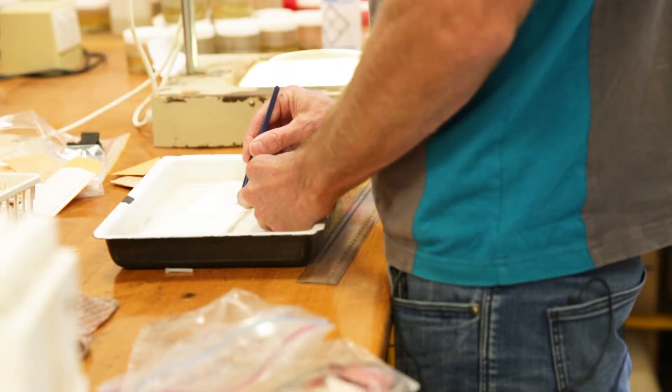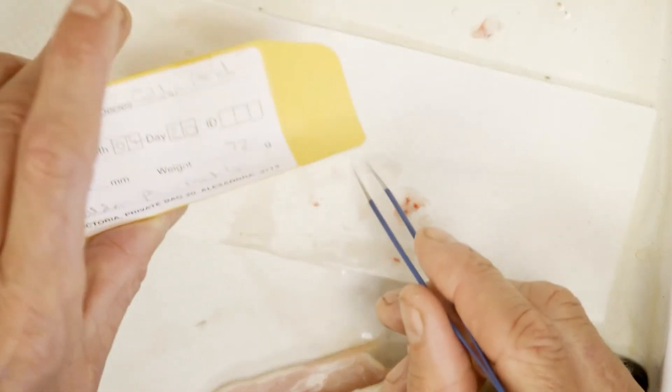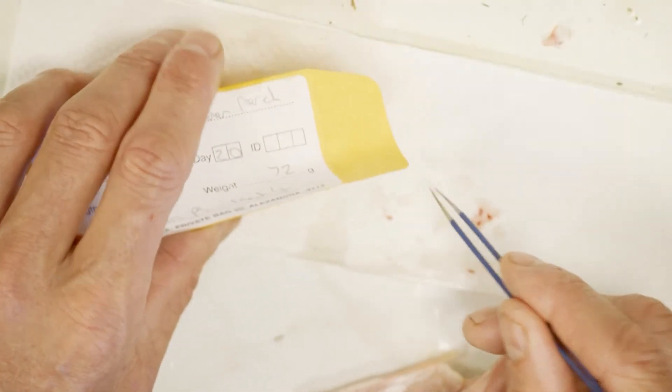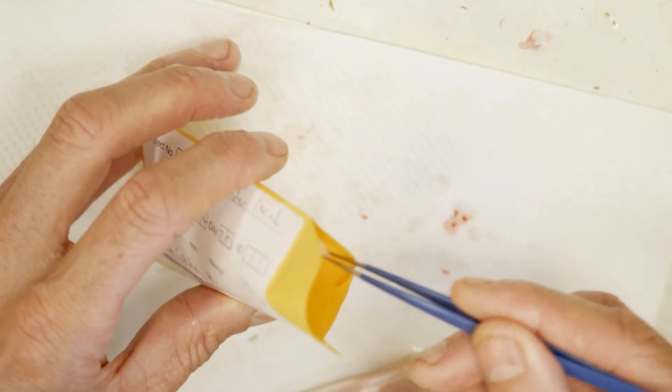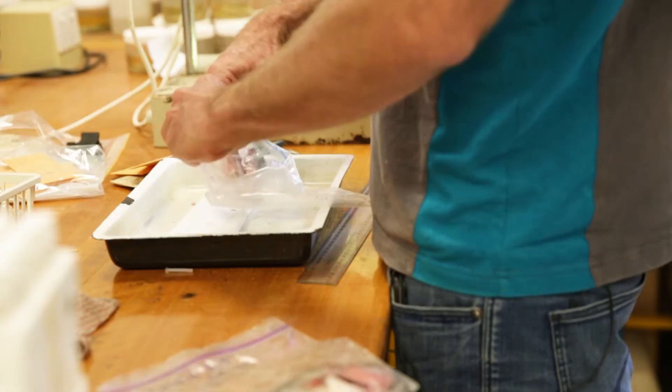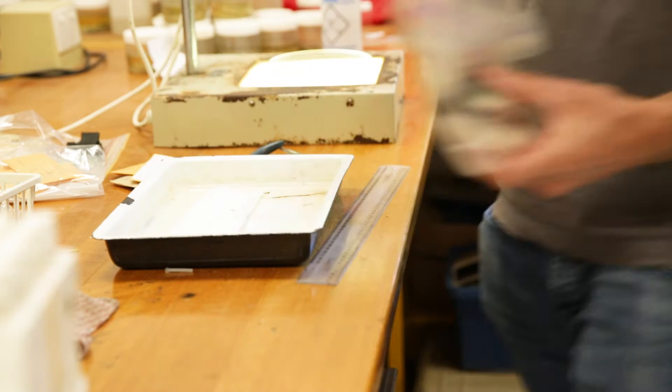Drop them onto a bit of paper towel and blot them dry. Once they're fairly dry we'll store them into paper envelopes, the front of which has the details of the size of the fish, the location and date of capture, and that's it.